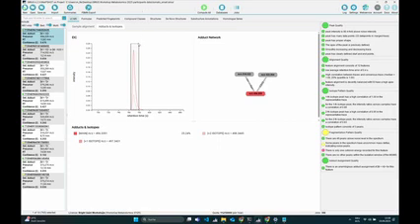So a score of -200 can be a very good score for one feature, and it can be a very bad score for another feature. That's why we developed the confidence score, because the CSI FingerID score is not good in differentiating results on a global scale.